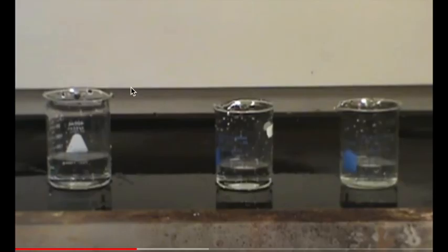Okay, so here I just want to show a quick short movie on how the reaction of sodium mixed with water looks. This is actually going to be three different alkali metals, but we're going to focus specifically on just first lithium and then sodium and then potassium, but we're going to look at one of them just to observe what happens during that reaction.